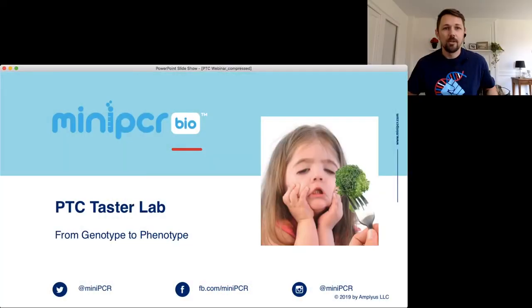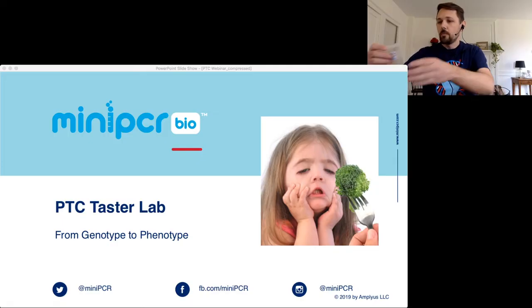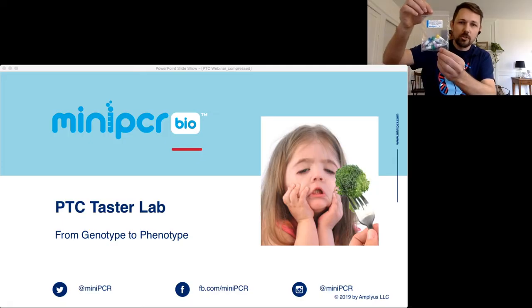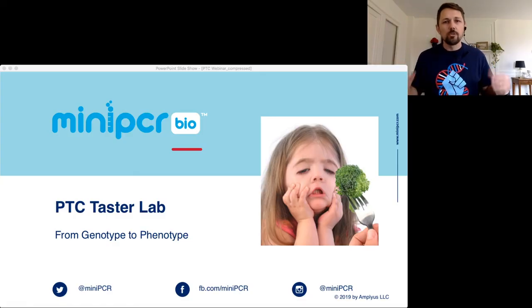All right, so let's dive into it. The PTC Taster Lab, from genotype to phenotype. Just to be clear, when you get a lab, this is what you get. It's a bunch of tubes, and we'll go through every one of these tubes as we go. But today we're going to do this classic lab from beginning to end.